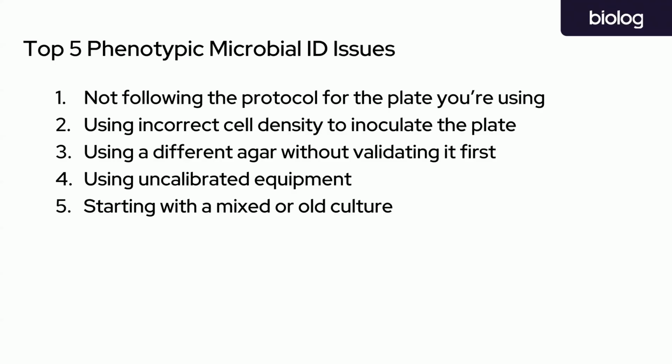As you are growing your microbes on a plate, this is especially critical for some yeast and filamentous fungi, depending on how long they take to grow. As they accumulate cells on the plate, many of those cells in that colony are going to be either dead or static. When you transfer those to the inoculating fluid to generate your suspension, you have an artificially high cell density made up of mostly dead cells.